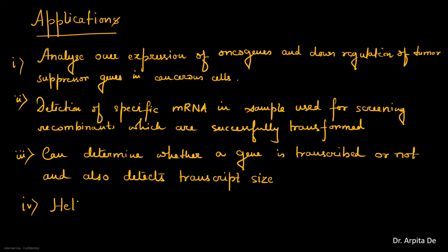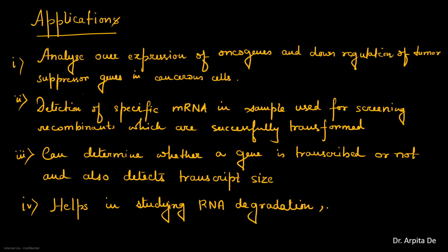It also helps in studying RNA degradation, splicing and half-life.